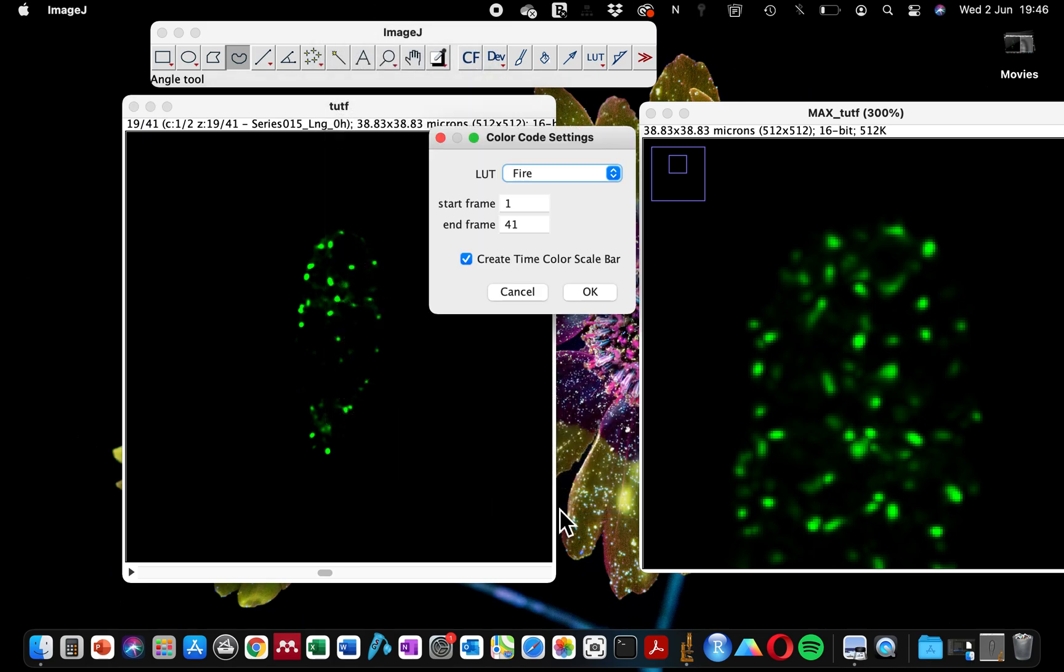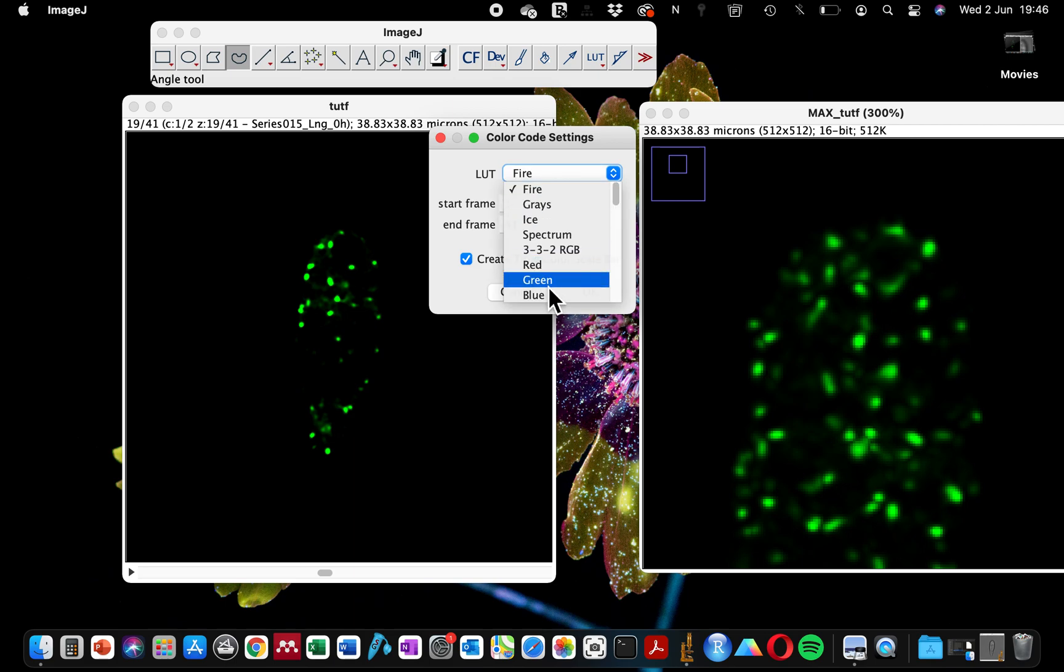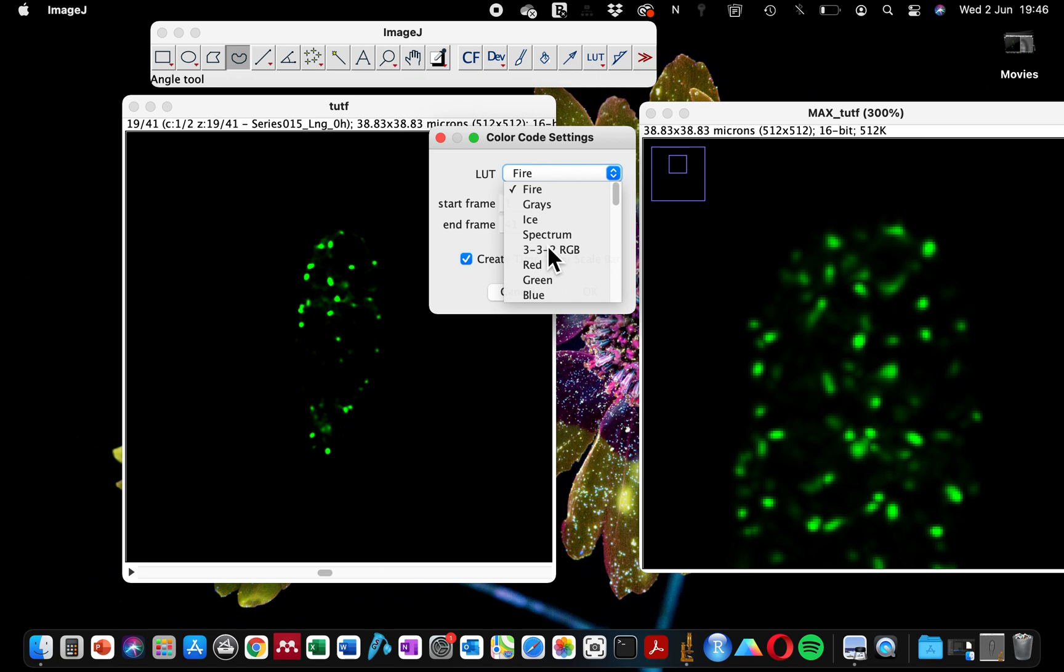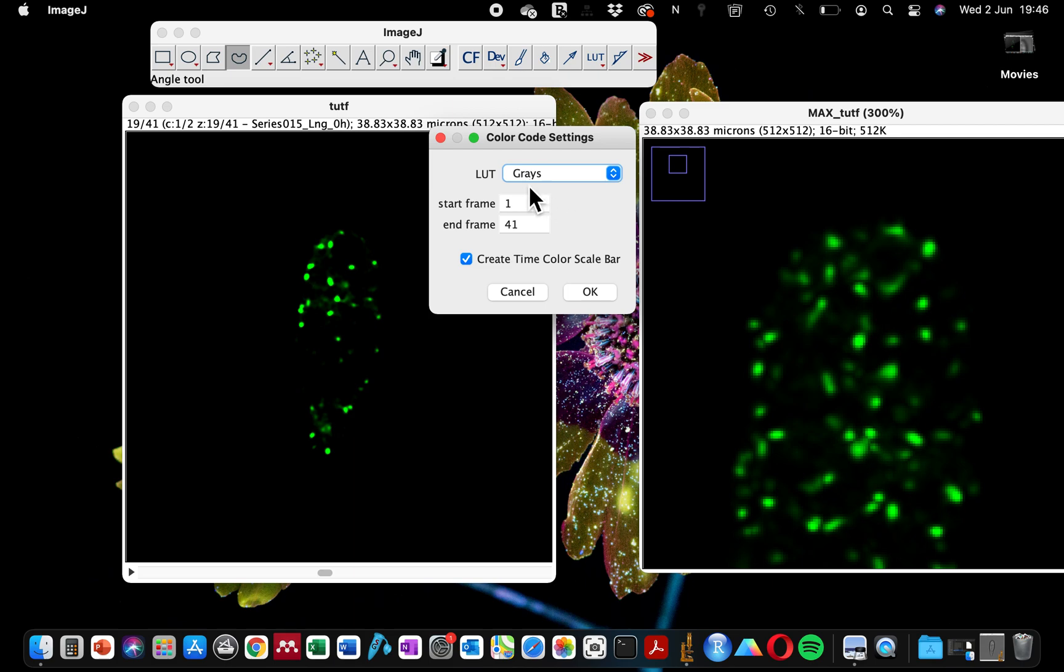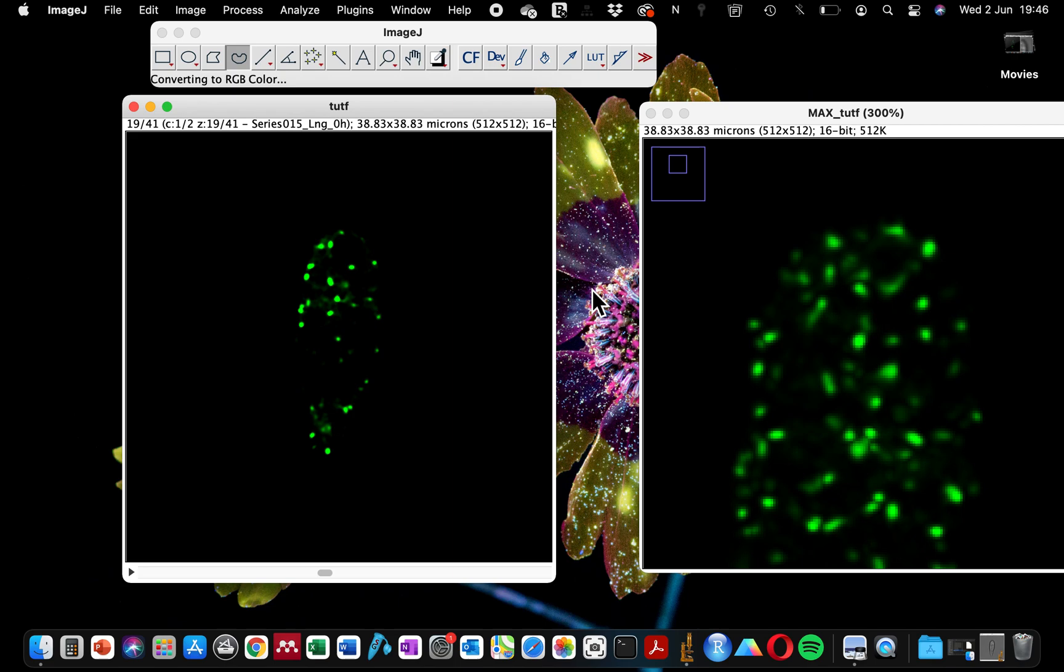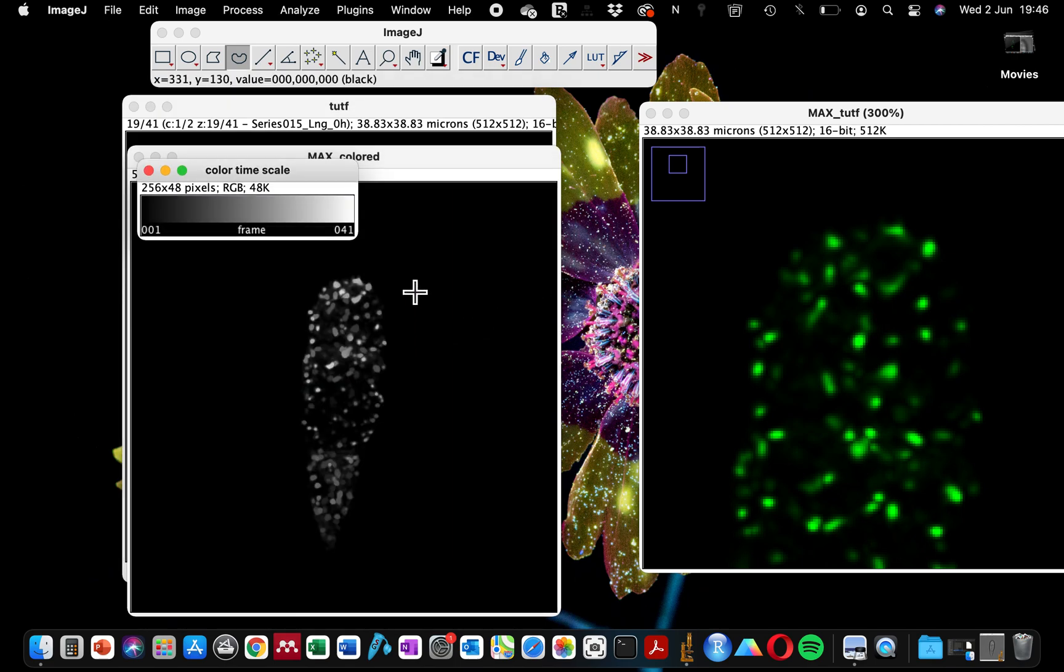If you click on Timelapse Color Coder, it's going to ask you which color format you want to project your color coding. It's not advisable to choose a gray color because this will just show you the different shades of gray. I'm going to do this and then you can see what I mean.